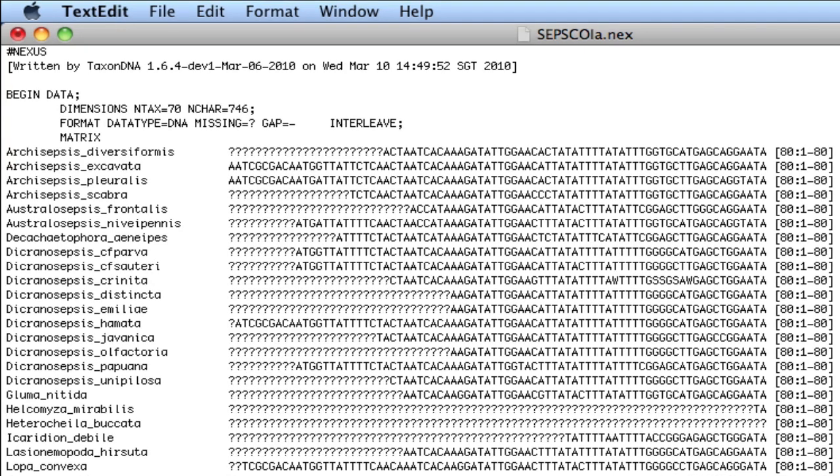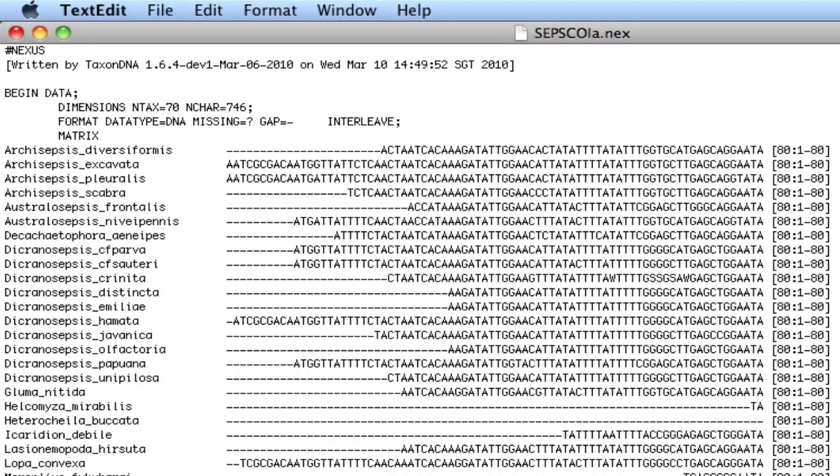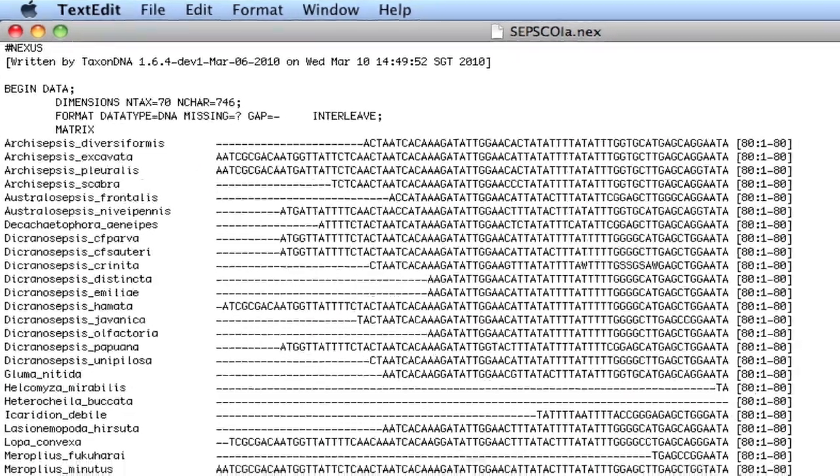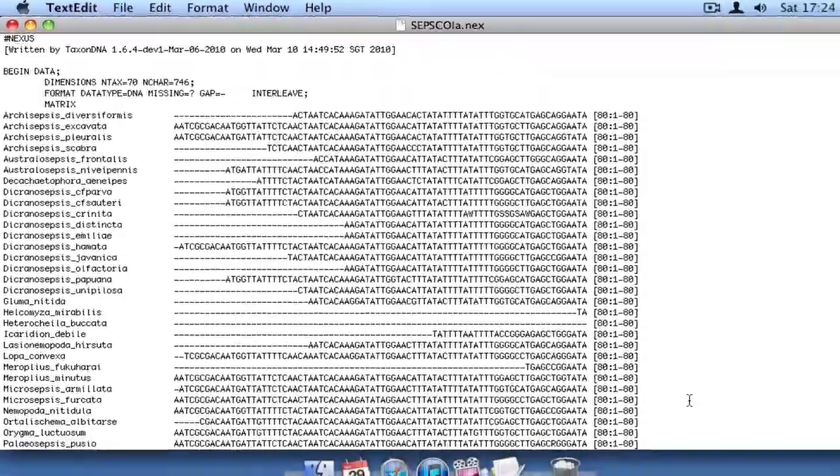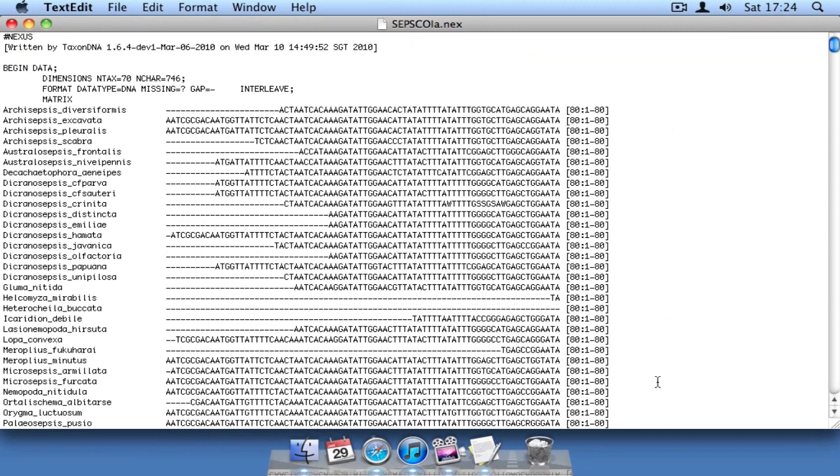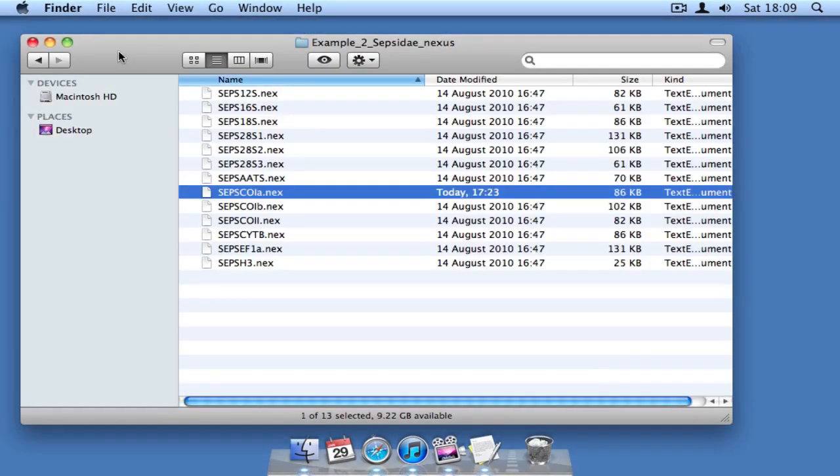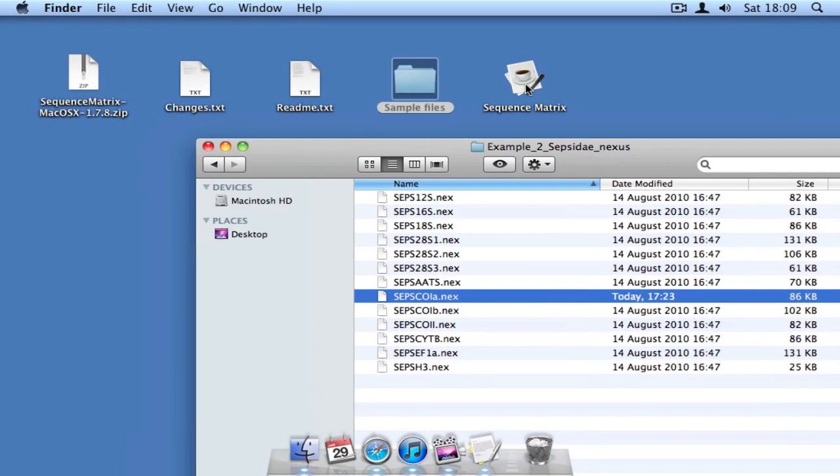We could do a search and replace, but this would also encode real gaps as question marks. You'll see in a moment how the program takes care of this potential problem.